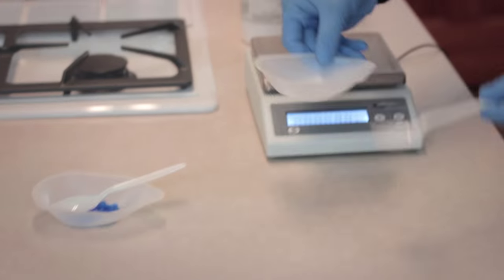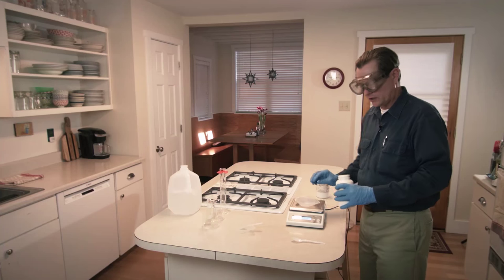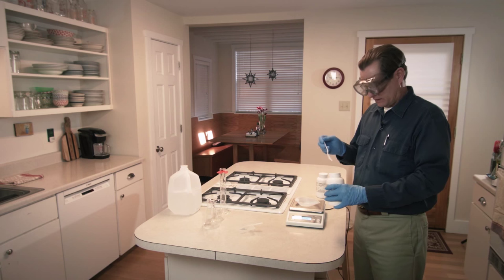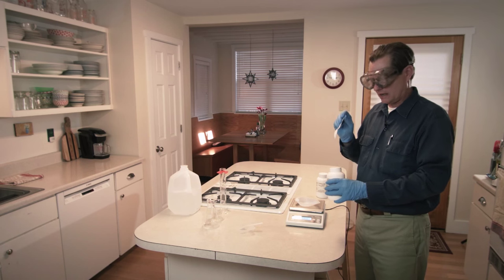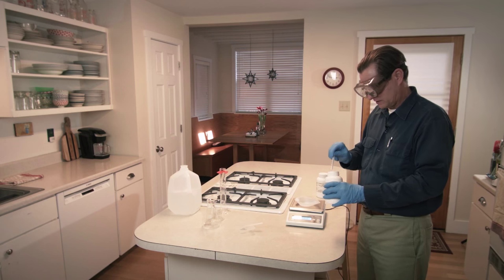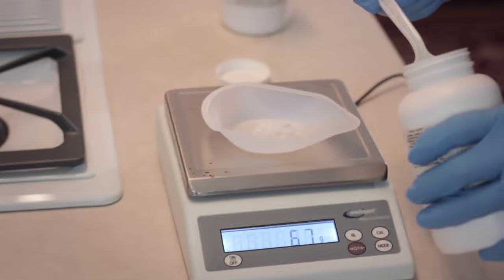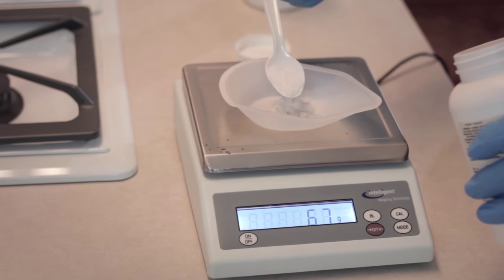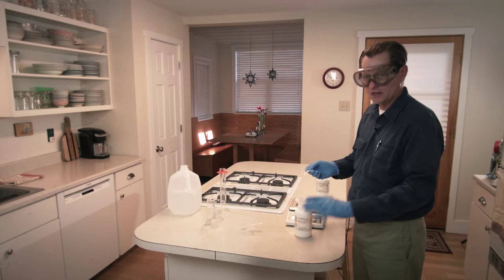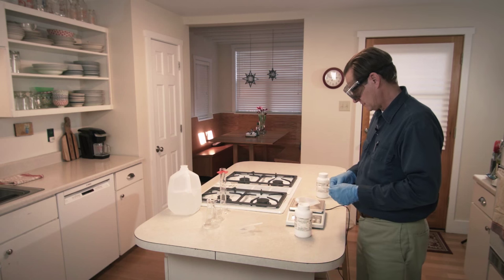Now I'm going to weigh out 10 grams of sodium hydroxide. Sodium hydroxide is what used to be called lye — they used to make soap out of it. It's quite harsh and you do not want to get this on your skin, so you need to wear gloves. Latex gloves will work, but it's common these days to use nitrile gloves because of latex allergies.